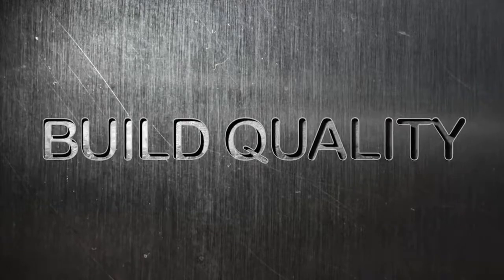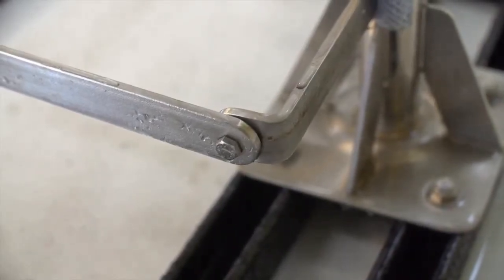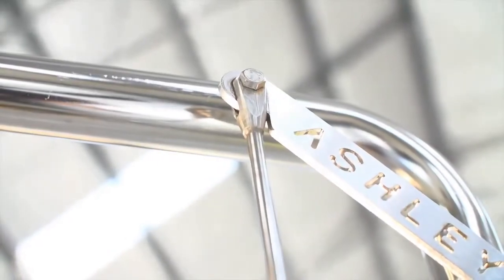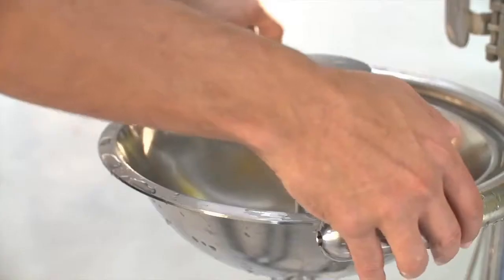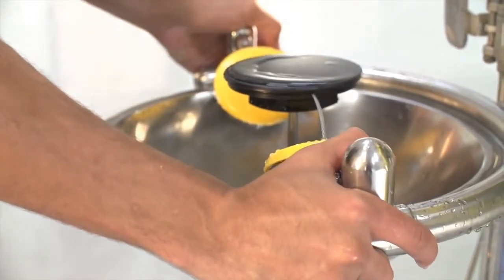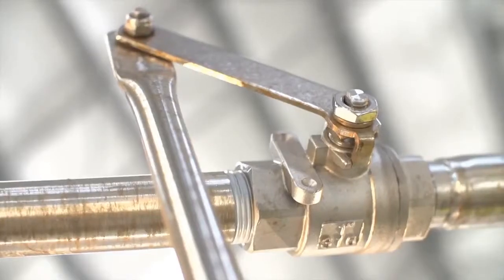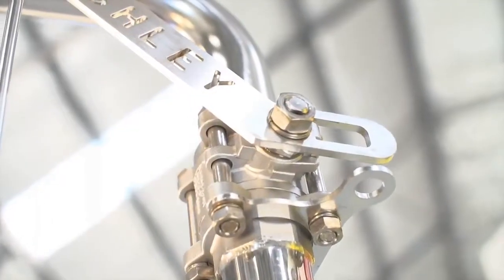Overall build quality. The Ashley Safety Shower has a superior build quality to other showers. Each part has been carefully engineered and designed, and no shortcuts have been taken. Every point of the design has been purposely rounded off for safety reasons, and the entire unit is constructed of marine grade 316 stainless steel. Where other showers corrode after just months of use, Ashley's is built to stand the test of time.